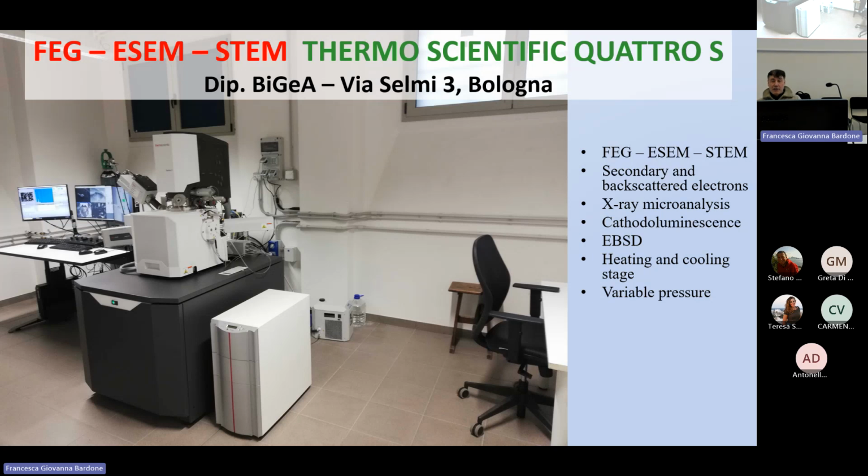If you want to increase the resolution with the chemistry, you need to prepare the sample in a different way. But we will show you how. This is just the first slide. When you have electrons which come through the specimen, you have ionization inside, and the region in which ionization occurs is much larger than the region from which the secondary electrons come.